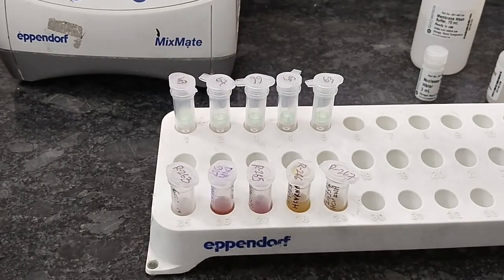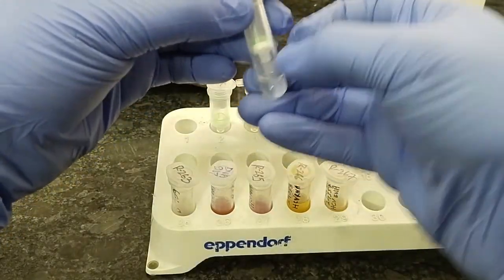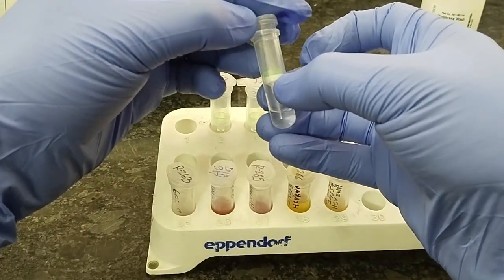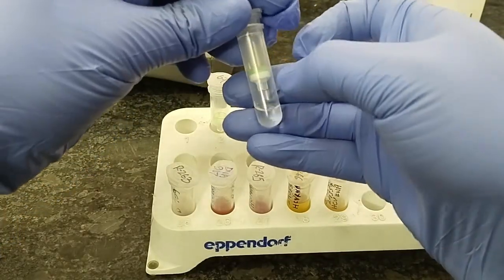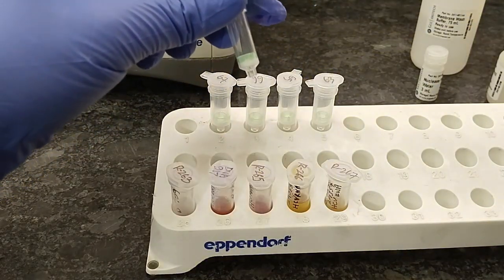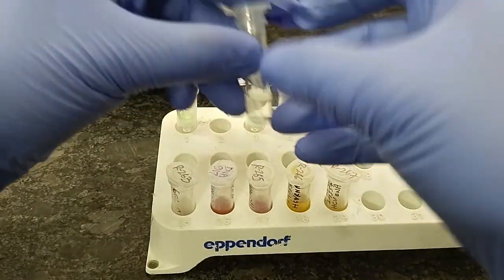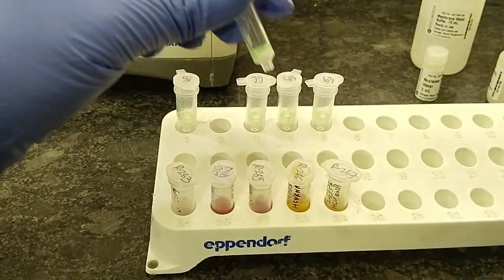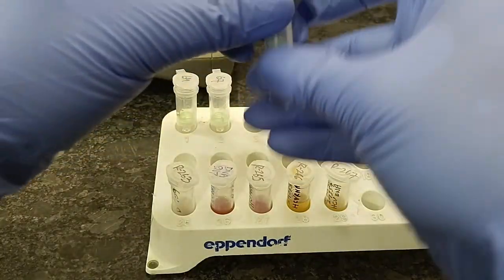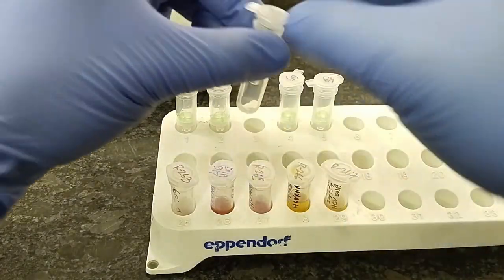Centrifugation for the second time is done. As seen earlier, the flow through is collected in the collection tube, and if there is RNA, it may get trapped in the binding column. So just discard the flow through, put the collection tube back and attach it to the column.